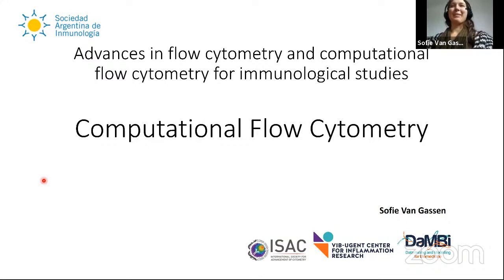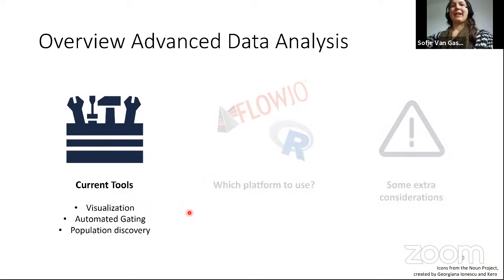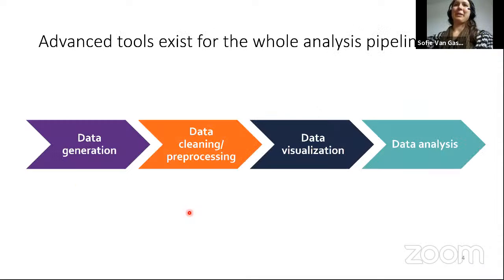And I will talk to you today about computational flow cytometry, like was introduced, which is my main topic of expertise. I will talk first a bit about the different tools which are currently available in the field and which might be interesting for you to check out. Then I will shortly touch upon which platforms you can actually use to run these tools. And then I will end with some extra considerations you should take into account when you're considering using these computational tools for your research. So I'll start with the different tools which are available.